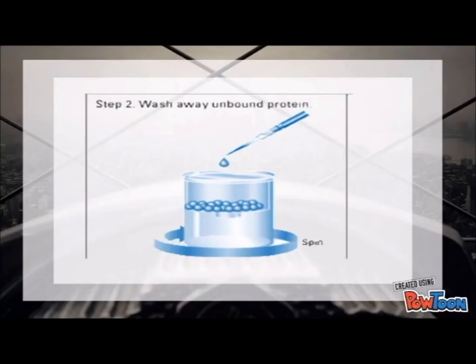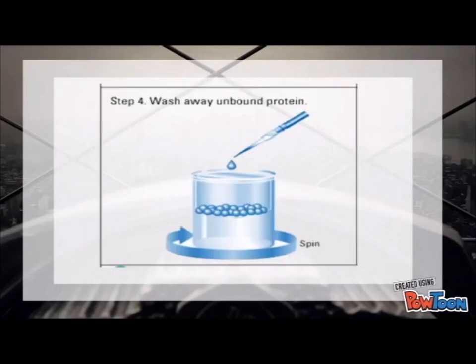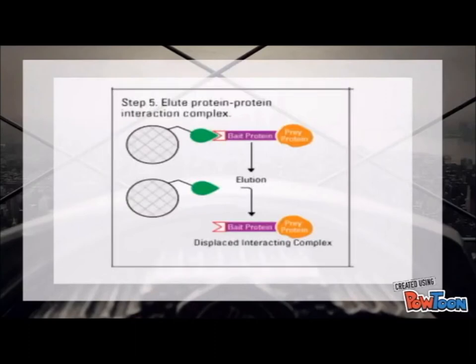Next, we load the supernatant cell lysis buffer over a glutathione column. And then you must wash the column with the free reduced glutathione. The free glutathione will replace the immobilized glutathione and release the GST tag protein. The next step is the GST eluted protein: you must run it over the NAP10 column to remove the free glutathione. As a result, you will get a very pure sample that contains only GST protein.